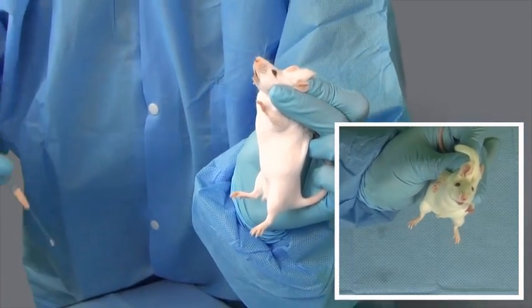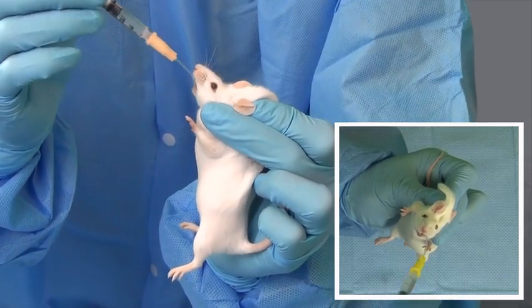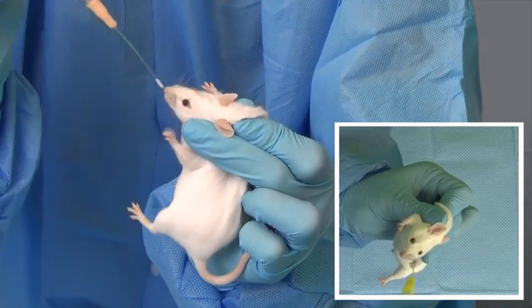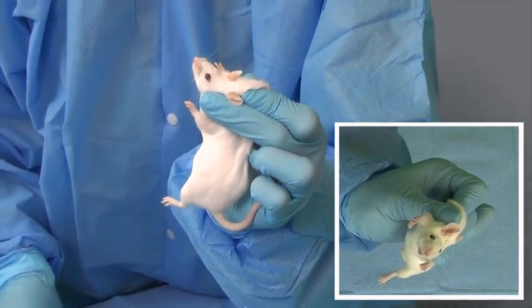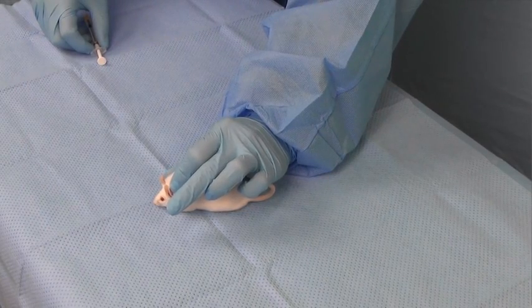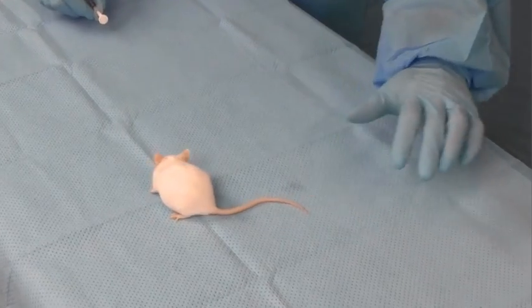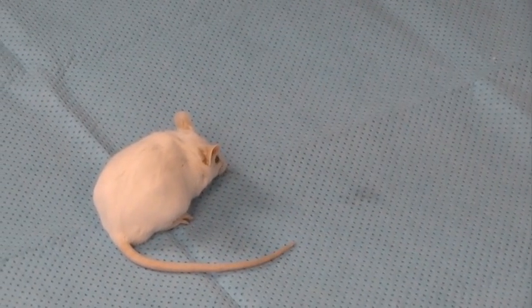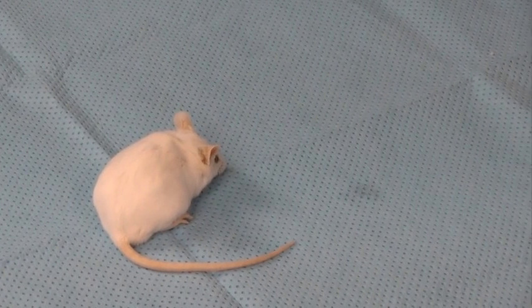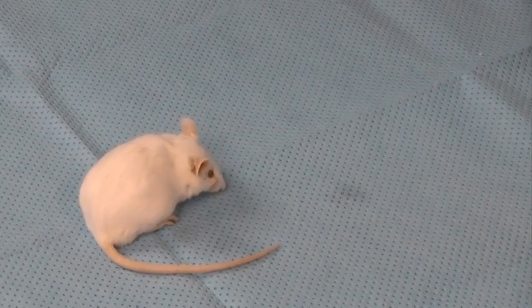Compound administration should be controlled but swift, as taking too much time could result in animal distress, but instilling compounds too quickly can result in reflux. The entire volume of compound should be administered before the feeding tube is withdrawn. The mouse should be observed after the procedure to make sure that the respiratory rate and effort are within normal limits. Once the mouse is determined to have been gavaged successfully, it should be returned to its cage.